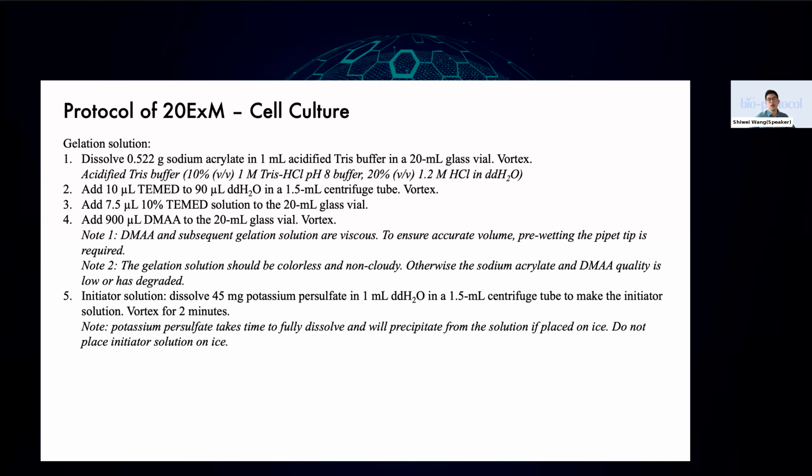So we put all the catalog numbers and vendors for the chemicals we use in the protocol, and I would highly recommend using the exact chemicals that we use. And if there's any problem with the chemicals, we would be happy to answer any questions.